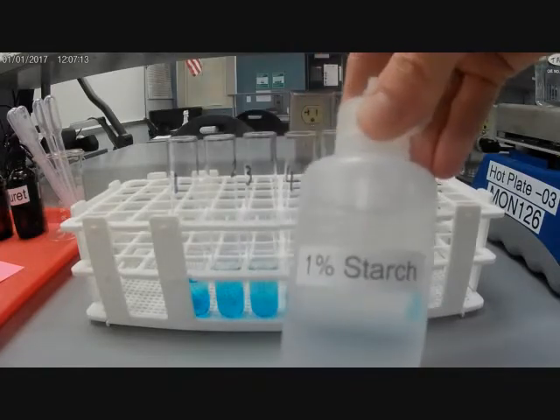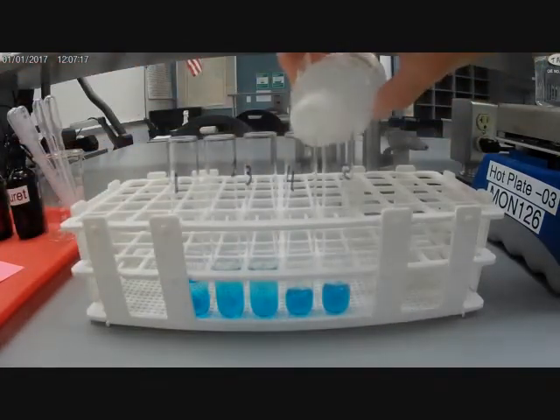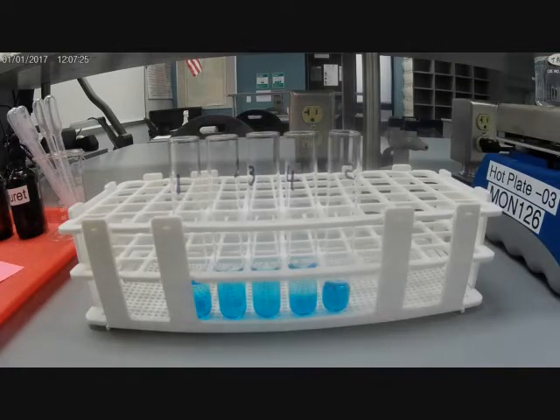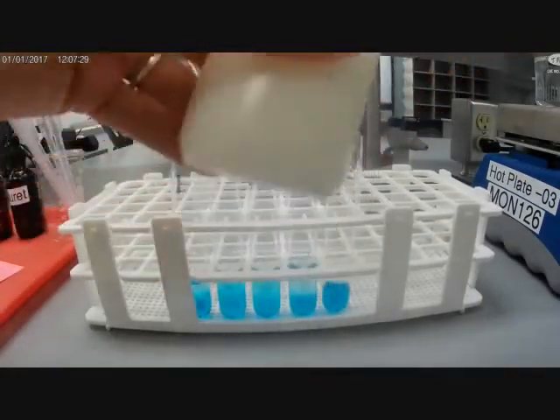Tube number four: starch. And finally, tube number five is going to be the milk that we found in the fridge.